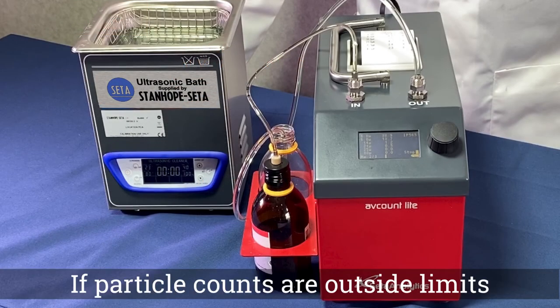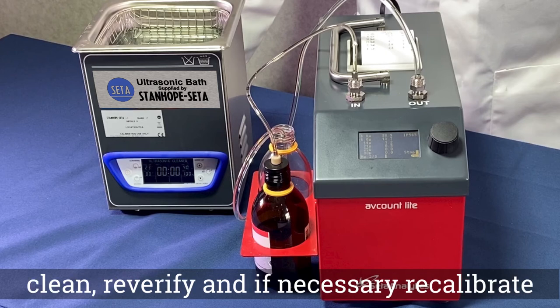If the counts are outside the stated limits, clean, re-verify and, if necessary, re-calibrate your instrument.